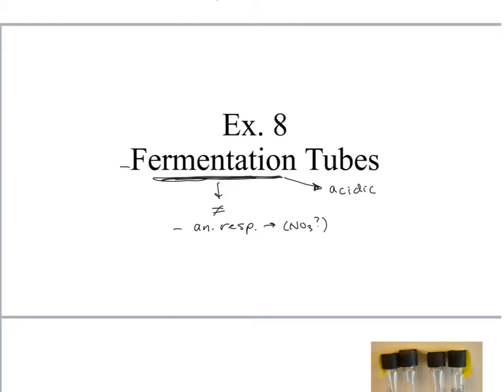Okay, so we're going to test for a low pH there as evidence that fermentation has taken place. You will get acidic end products from anaerobic respiration or aerobic respiration, but not as much. All right, so when the pH dips pretty low, we can be pretty sure that fermentation's taking place. It may be some respiration as well, but a lot of fermentation.